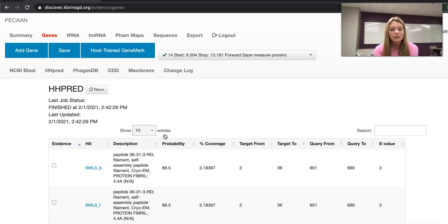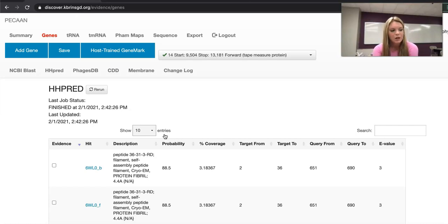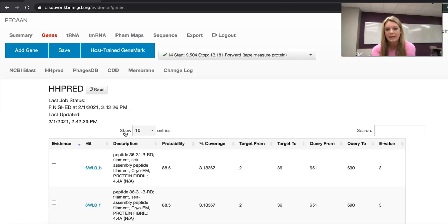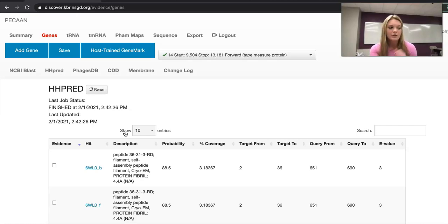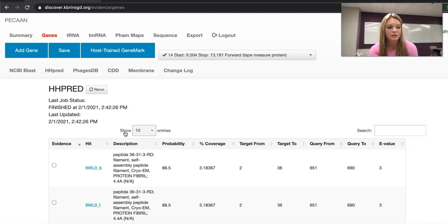The function of each gene being compared is listed on the main page of Pecan under HHPred. When a gene on the HHPred section has a function that is the same as the function called for the gene being annotated, it can be considered evidence for the called gene function of the annotated gene.